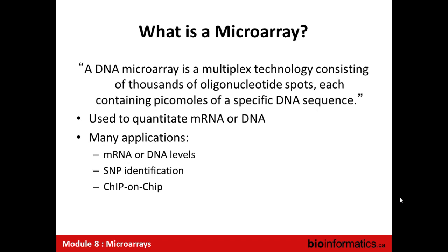And so that means that there's a wide variety of applications. Anything you can imagine measuring about DNA or RNA can be measured using a microarray. So fundamentally, it's a flexible technology. We shouldn't think microarrays only measure DNA, or they only measure RNA abundances. You can measure splice variants, genotypes, pretty much whatever you think of.